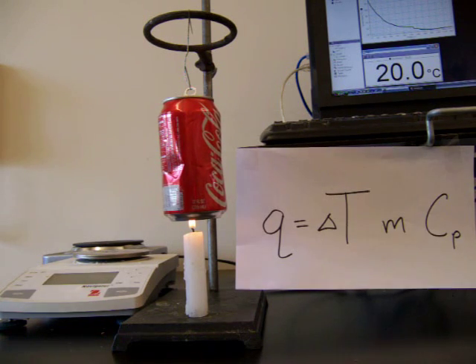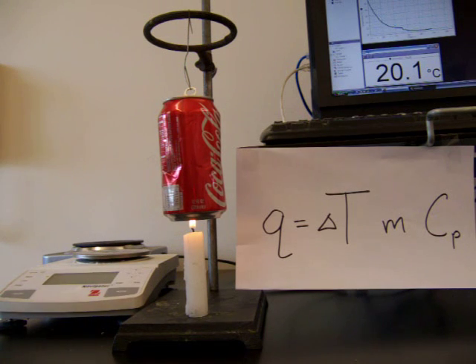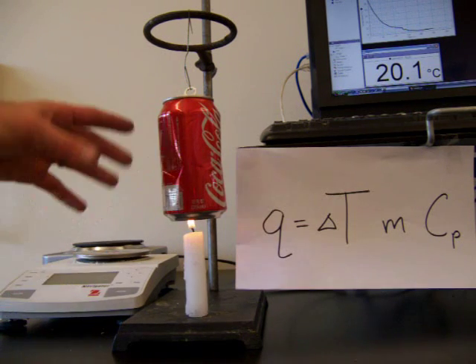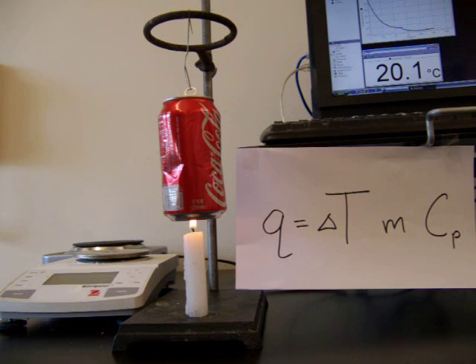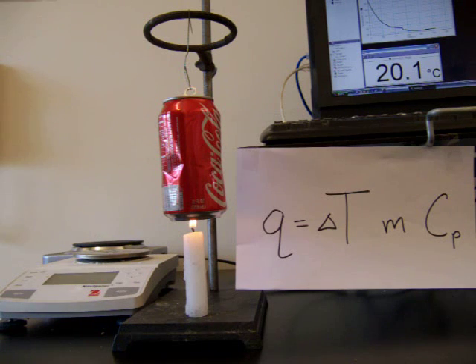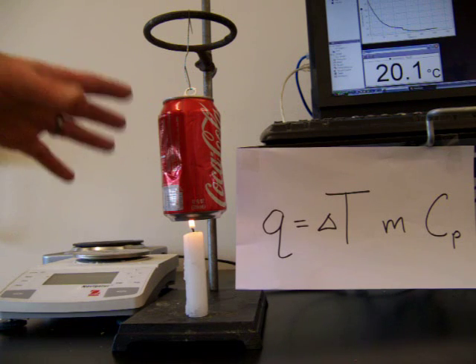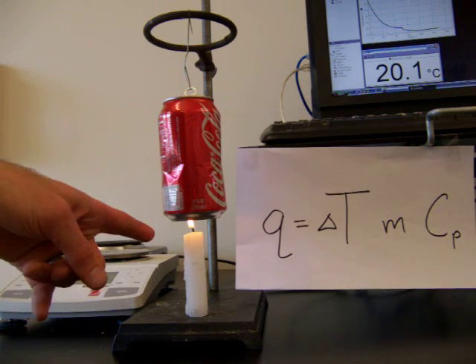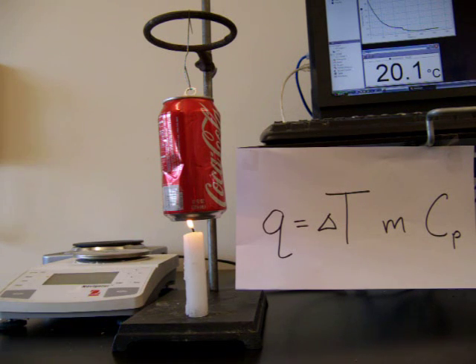So right now we're just continuing to let the candle burn. It's giving off heat into the soda can. This lab is good in that you can see the heat going up from the candle into the soda can, so it's kind of easy to visualize how the heat is going to travel from the candle into the water and how the water will become warmer. There are some downsides with this setup. This is not a well insulated calorimeter, so there's definitely going to be some heat escaping around the soda can, which we won't really take into account during our calculations. Generally, we're going to get a slightly lower value for the heat of combustion of paraffin than what the actual value really is.